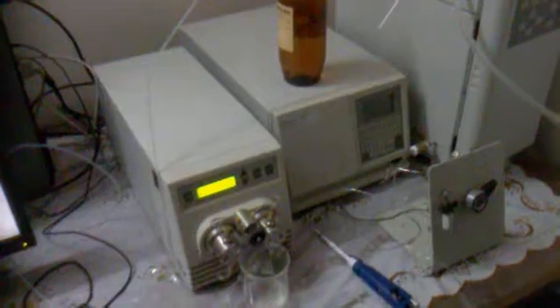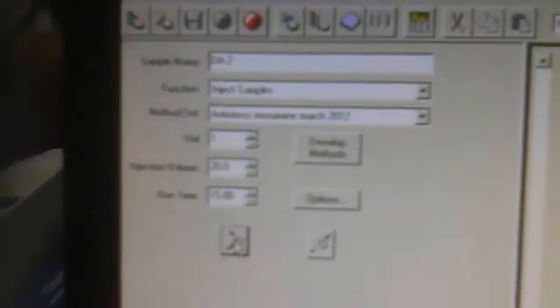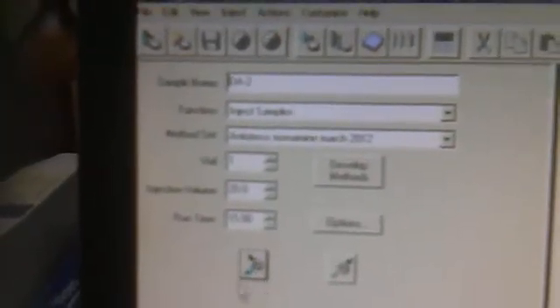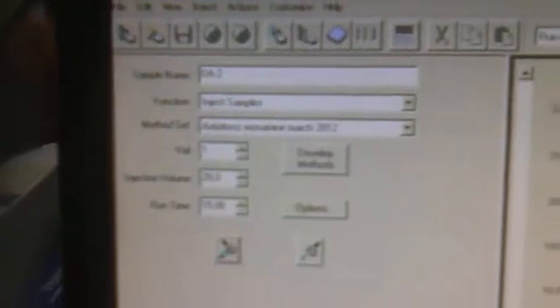When the sample is taken, we will first switch this to inject mode. So if I click here, it is inject mode. You can see that there is no reading here — no signal has been found yet.